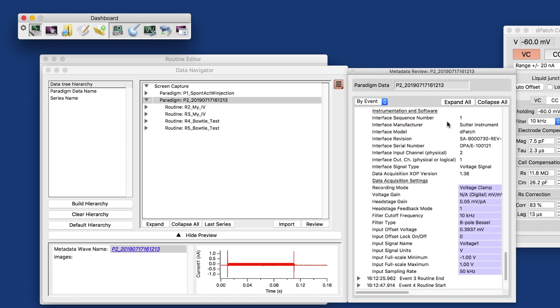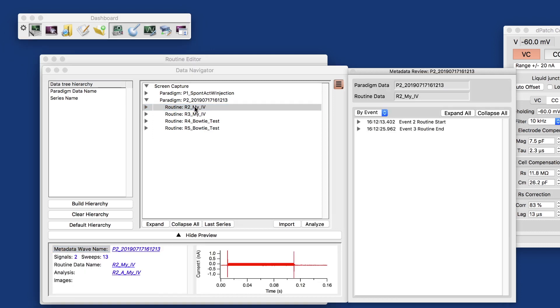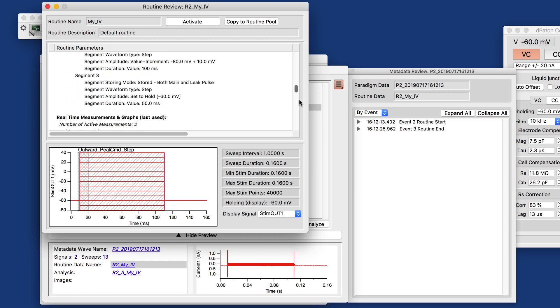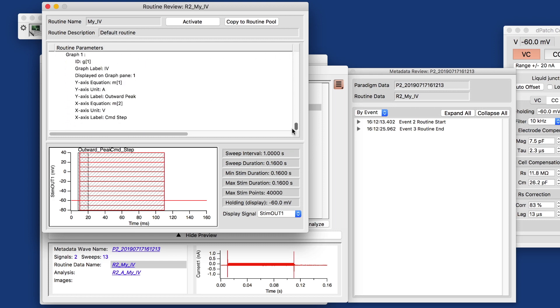And then this here, the metadata review is one way where you can see that. What else do we store? With the routine, we're looking at the routine. A copy of the routine that we executed is also stored and nobody wants to read the text description of what's going on. But in most cases, the waveform preview gives you all the information that you need, shows you, okay, this is what I did.